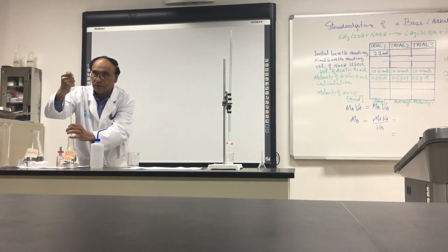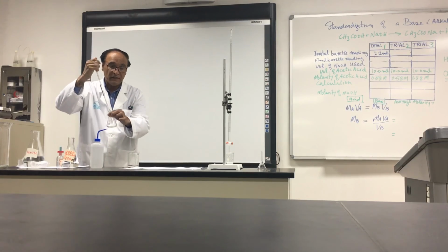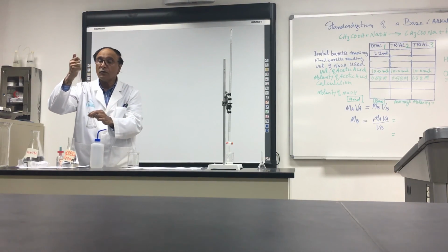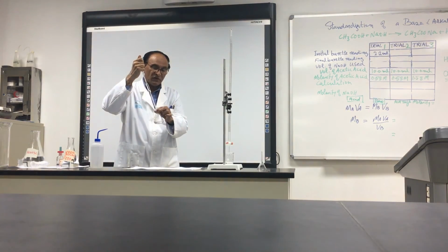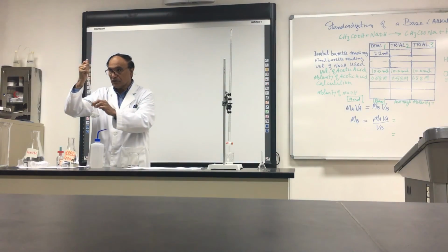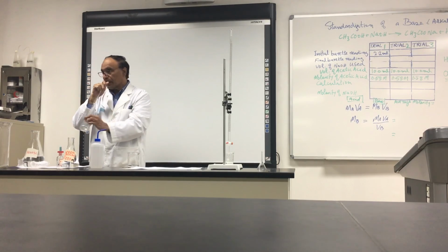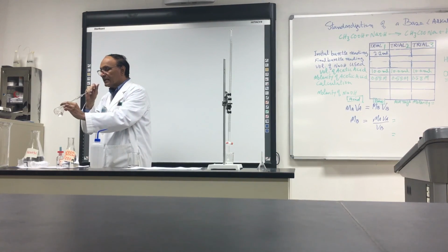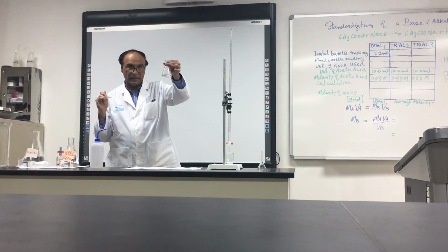Up to the mark and put it over here. The flask should be very close to you. Don't hold it and look to your flask. Where is my flask? No, many drops will fall down. The flask should be with you when you go there. Did you understand? Yes. Don't blow it. When it finishes, touch 2 times. There is a drop here. Don't worry about the drop. This is exactly 10 milli here.